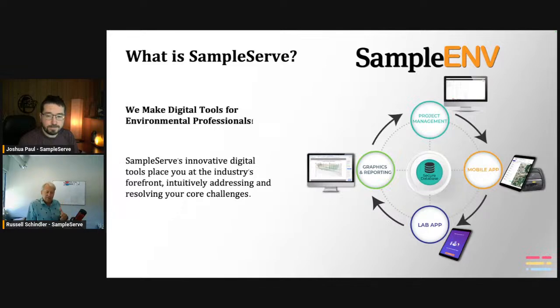What it allows you to do is other things while you're sampling, instead of sitting there and having to enter in the data manually, or in the old days, even writing it down on paper. You're able to just let the thing take off on its own and record the data at whatever time period that you want.